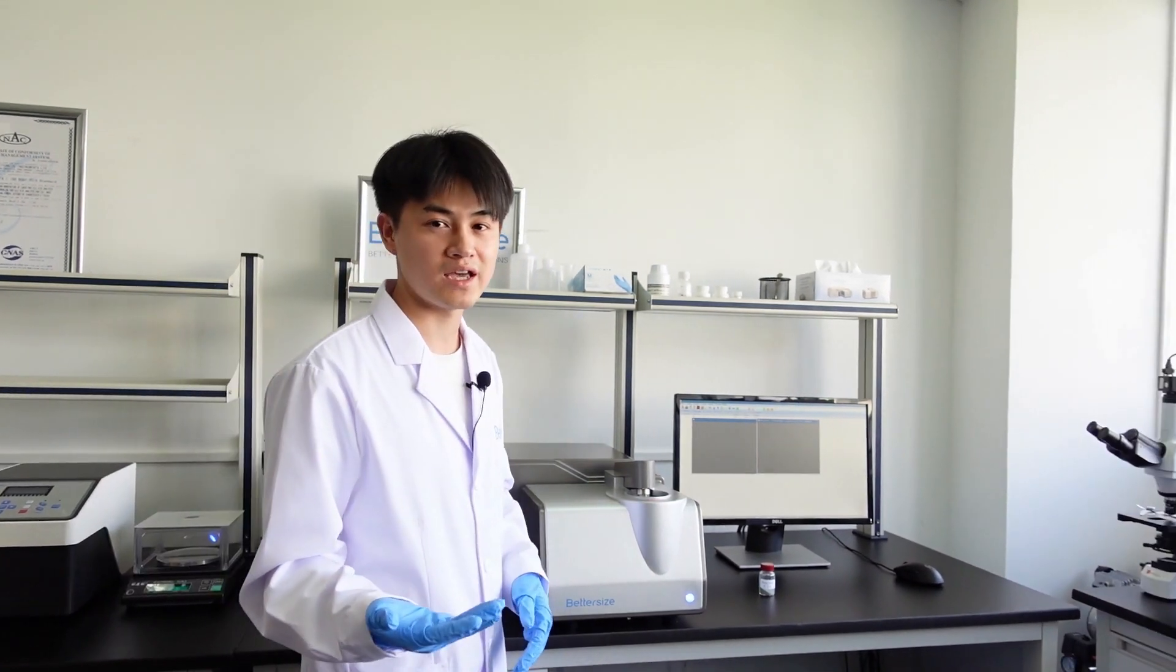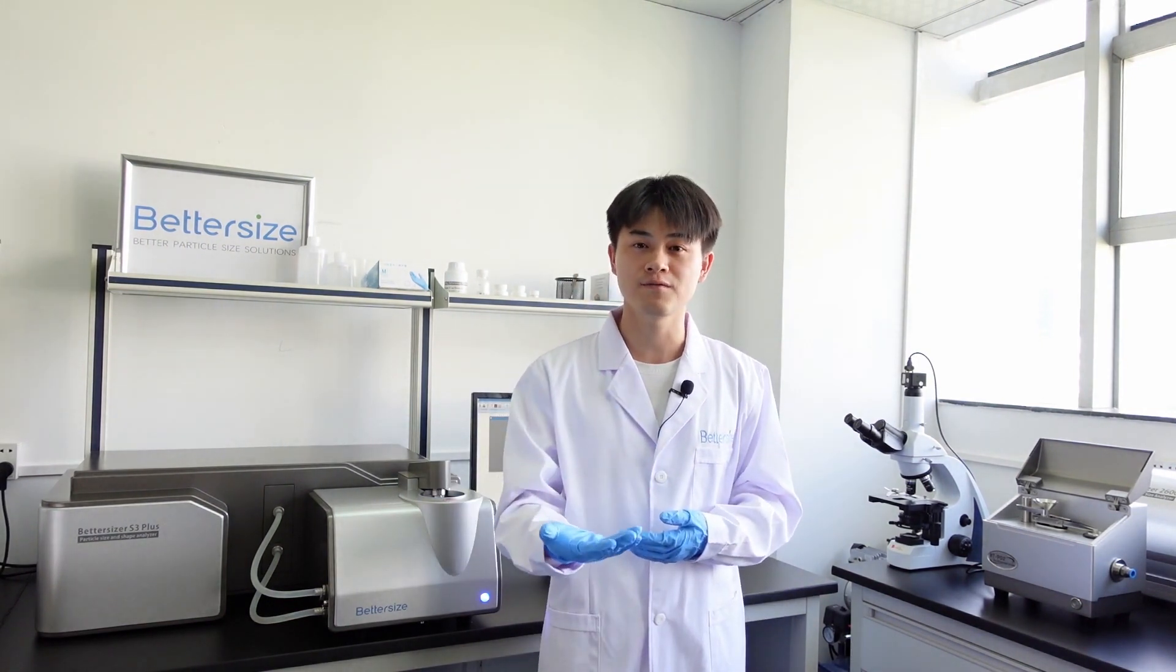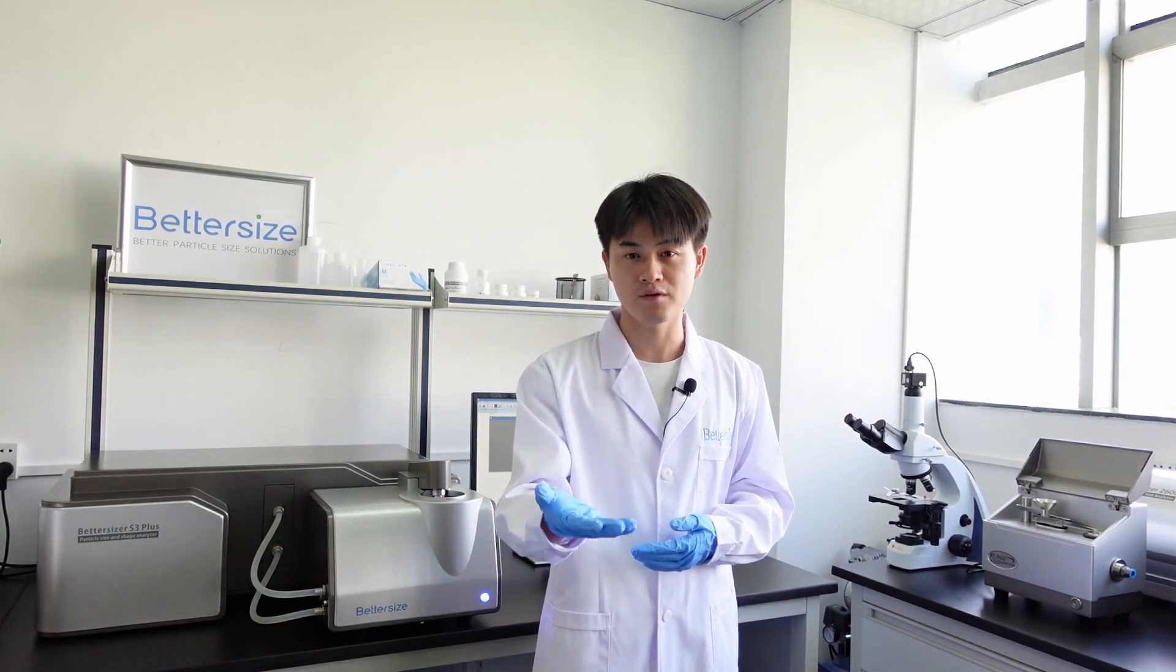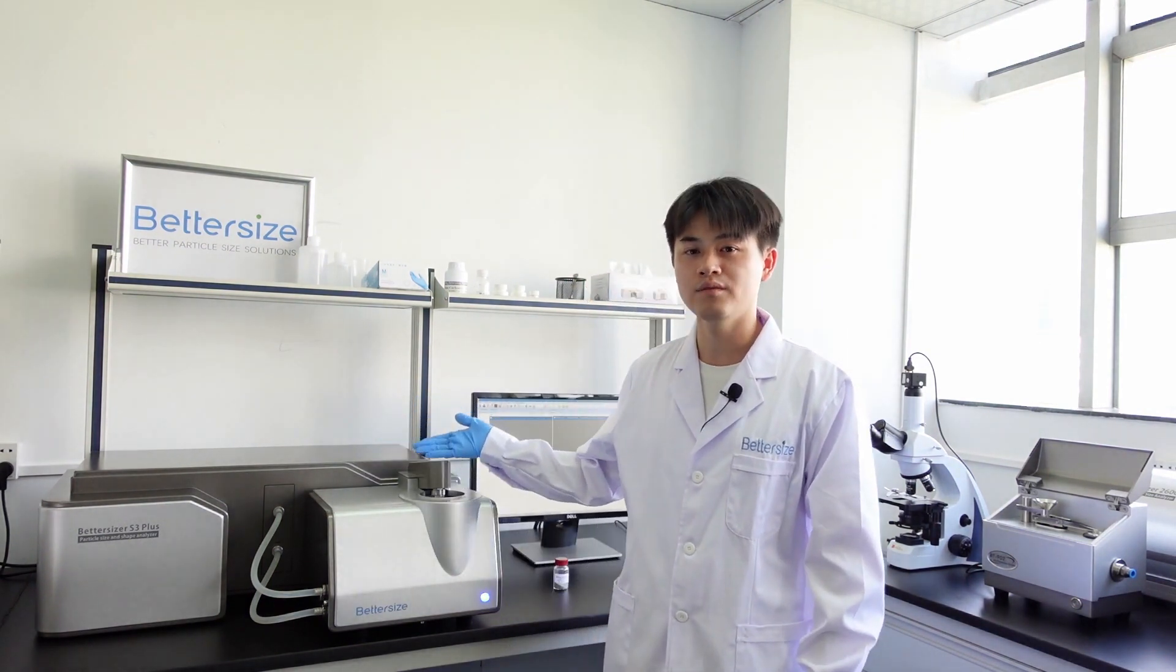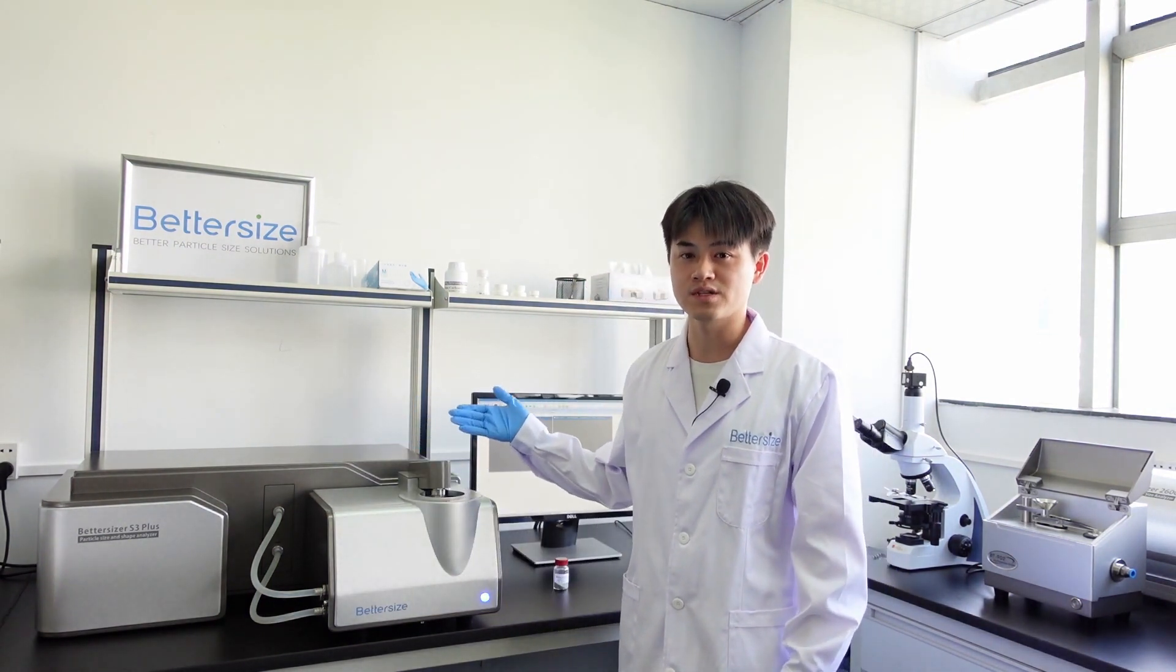Depending on your applications, the Bettersizer S3 Plus can use laser diffraction or image analysis alone or combine these two methods to present more comprehensive information of your sample. The versatility of the instrument makes it a popular choice in both industry and academic labs.